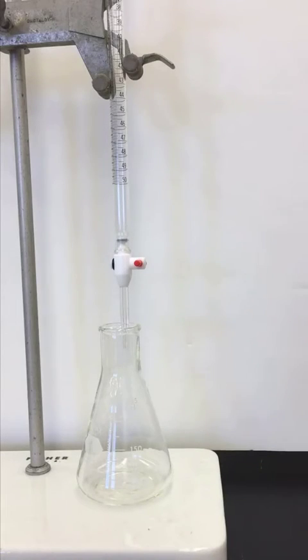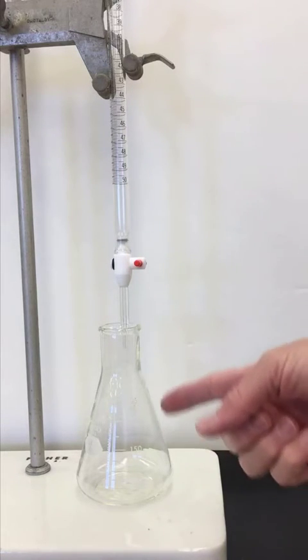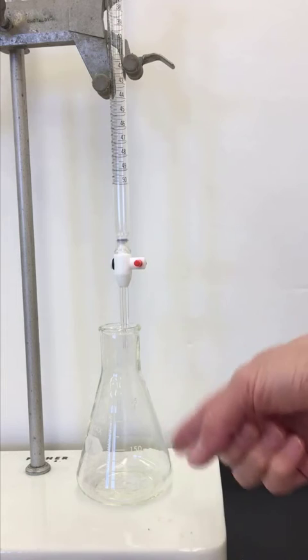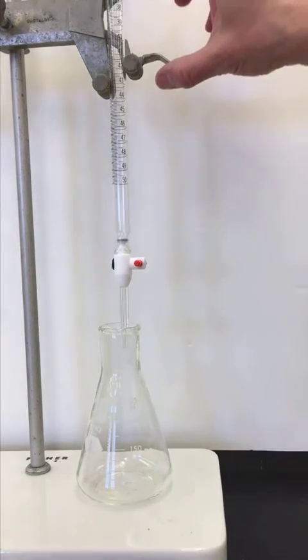So let's look at our burette. Our burette is a way to deliver volume of one of the reactants to a particular volume of our other reactant which will be in our Erlenmeyer flask. So let's look at the burette itself.